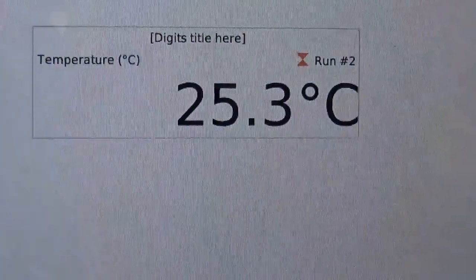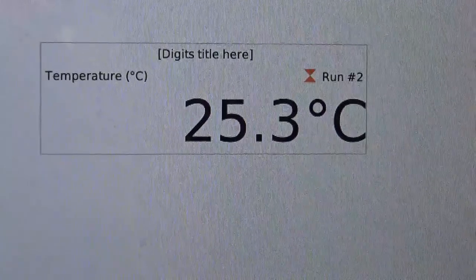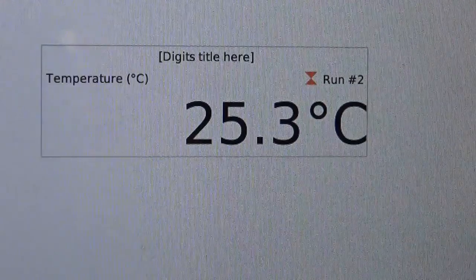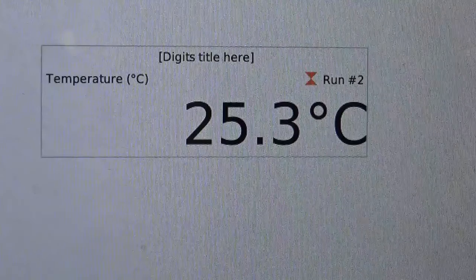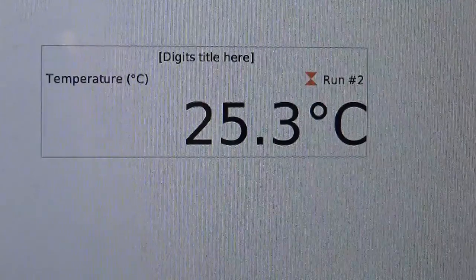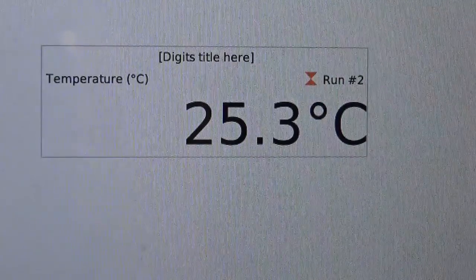And now the temperature is going down from the dissolution. So what does that make the sign of the delta H as the temperature is going down? Of course, now I have the heat on as well. I mean, I had it on, so it's still warm, so it's gonna start coming back up. Looks like it's right at the balance point. It's not doing anything.